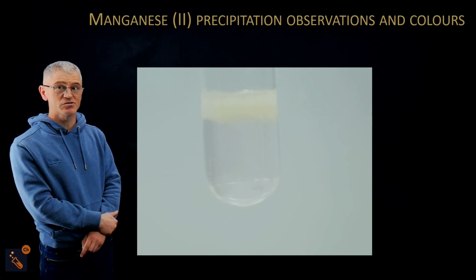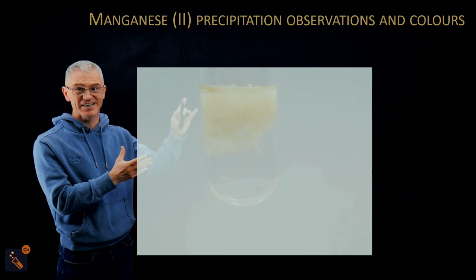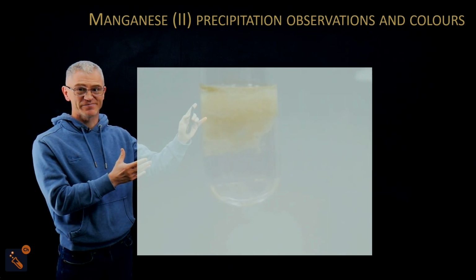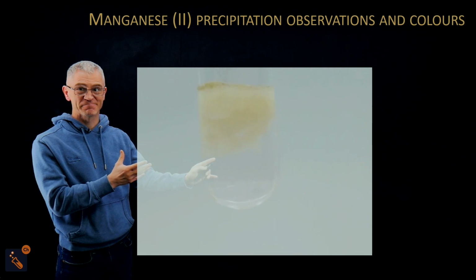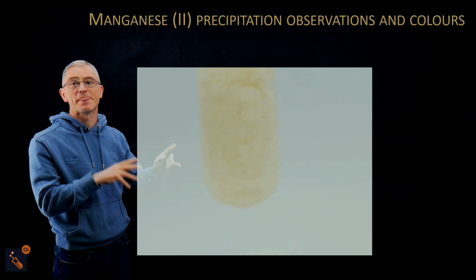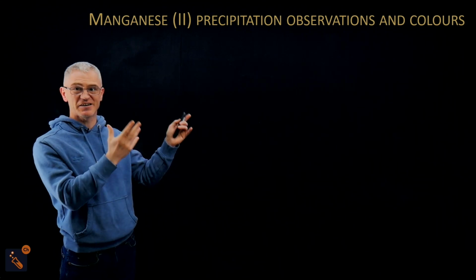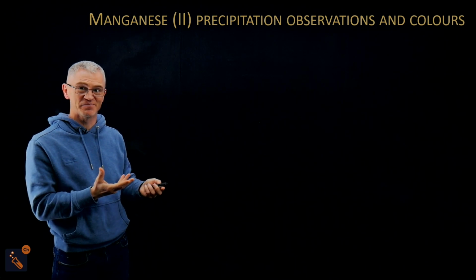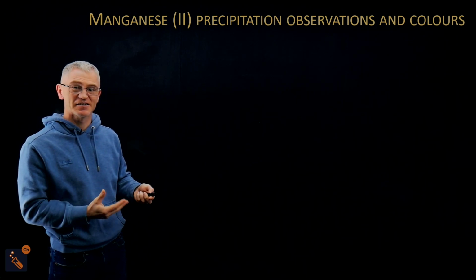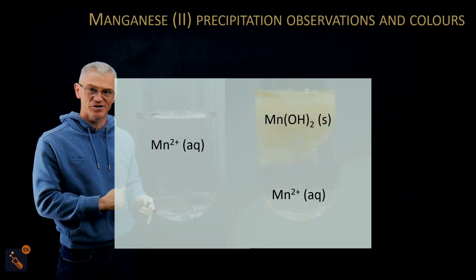So this is manganese. My students always laugh at this one because the colours don't look like they are here. That's meant to be a light brown. And that's meant to be pale pink. Okay, so the manganese 2 is pale pink, and that's meant to be light brown. Now, because it's in low concentration, it doesn't really look pale pink, and because of that, it doesn't really look light brown either. Okay, but if we look here, this is meant to be pale pink, and that is meant to be light brown.